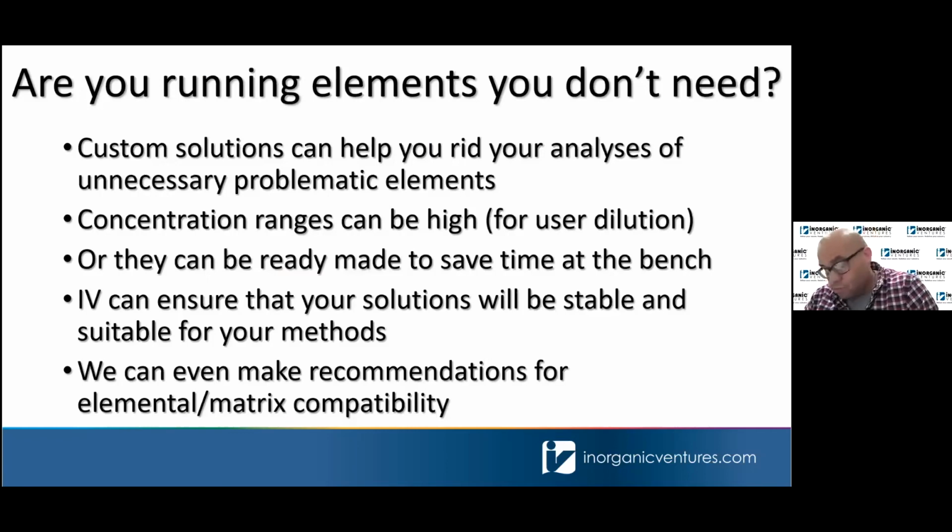So all this to say, as far as the problematic elements, don't run elements that you don't need that could be causing either compatibility issues for you or washout issues that could be affecting the analysis of some other elements.